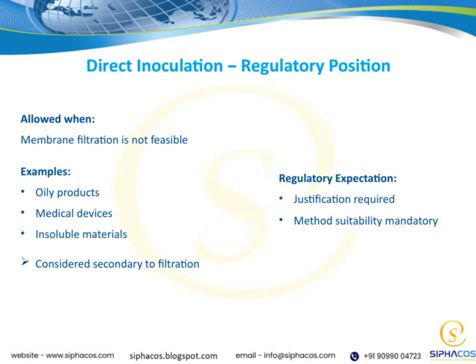It's also worth noting that direct inoculation is generally considered secondary to filtration. That means, whenever possible, filtration should be the primary choice, and direct inoculation should be used only when filtration isn't a viable option. This approach ensures we meet regulatory standards while maintaining the integrity and safety of our processes.